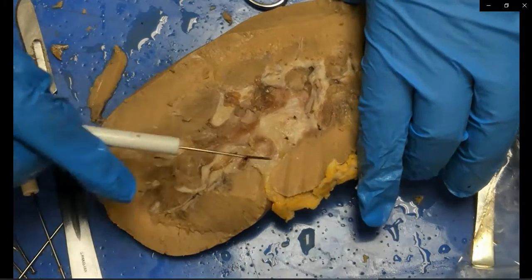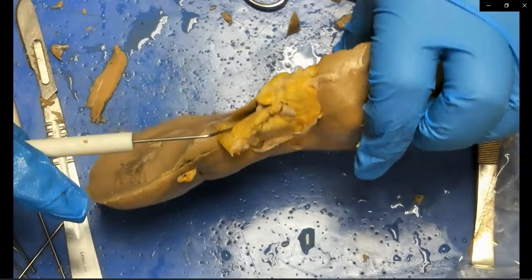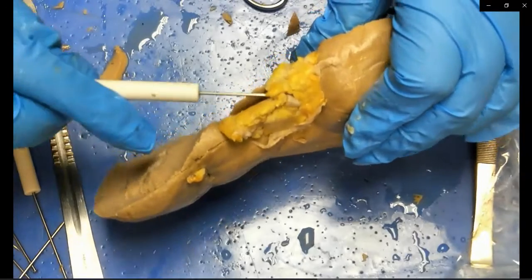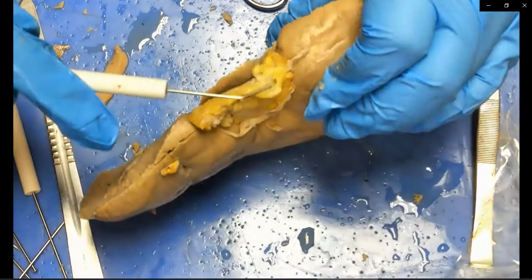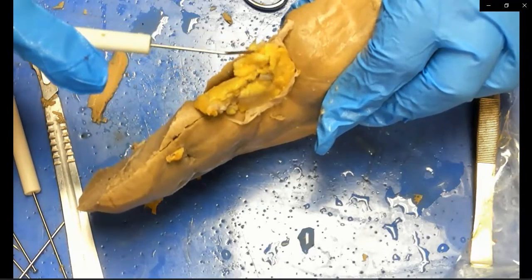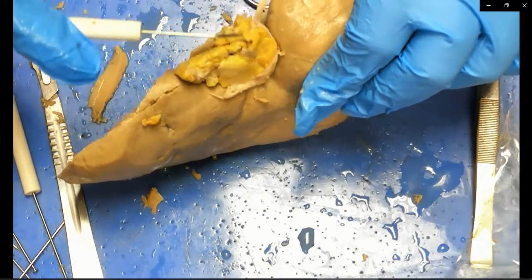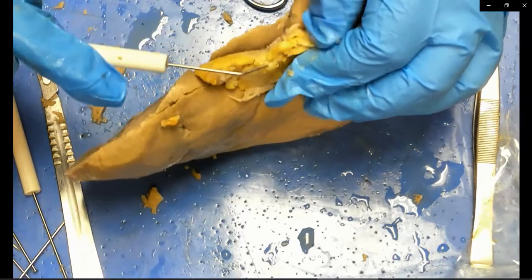Okay, so here's that renal pelvis. After the renal pelvis, we're going to come out, and again, this fat-covered portion is going to be the ureter. Okay, and let me see if I can actually try to reveal that ureter here. It's taking a little while, but it's in there.